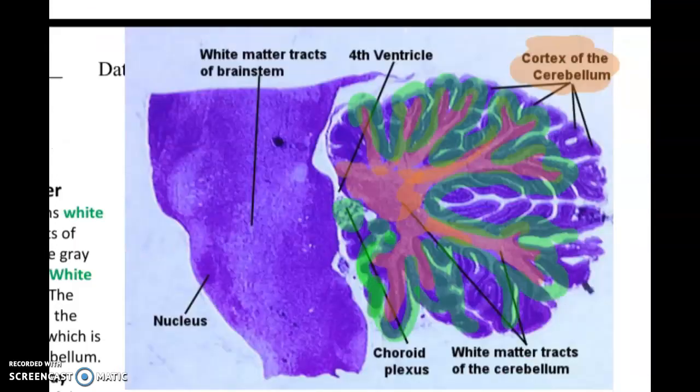Now, in the cerebellum, that's the small brainy thing, inferior and posterior on your brain, and the cerebral hemispheres, that's the large thing you think of as your brain, gray matter is going to be superficial to white matter. The brainstem actually is going to resemble the spine more than it does the rest of the brain. We're going to have gray matter in these things called nuclei. And these nuclei are going to then be surrounded by white matter.